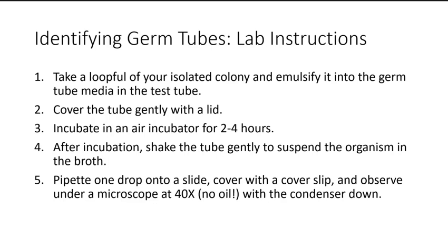Candida tropicalis actually looks like round clusters on a wet prep. I'm going to try and get some germ tube media for lab, but I'm not sure if I can.